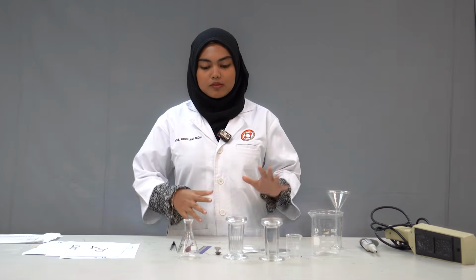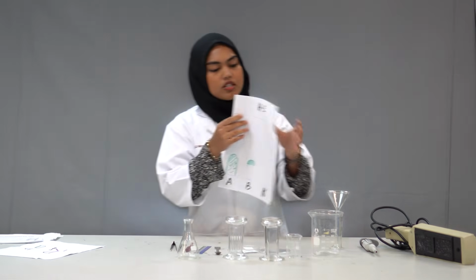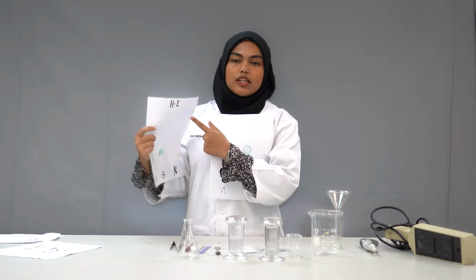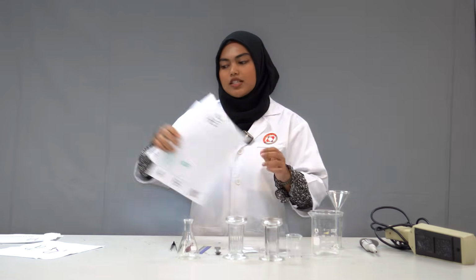Okay, hi everyone. I will continue the presentation with the result and the discussion of the result. So this is our result. As you can see, this is the mixture of hexane and ethanol, and this is the DCM, dichloromethane, and hexane. Let's put that aside first.